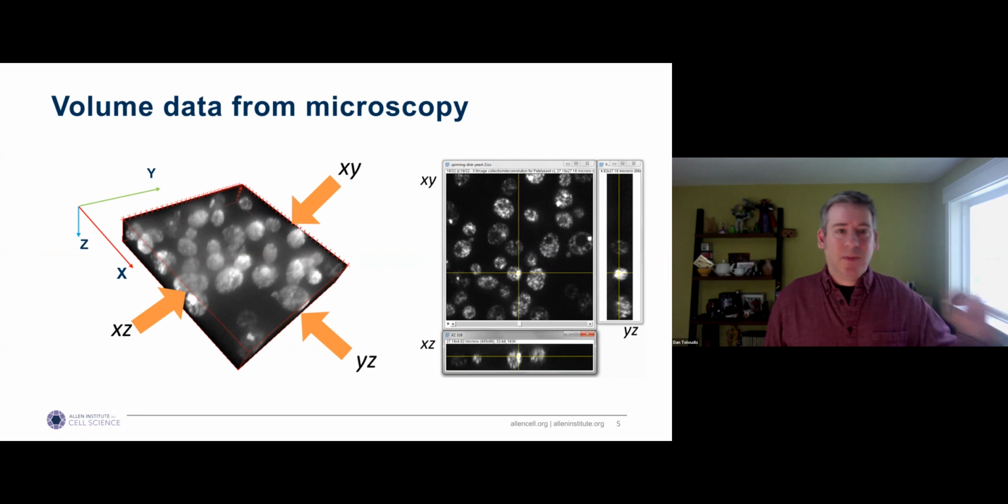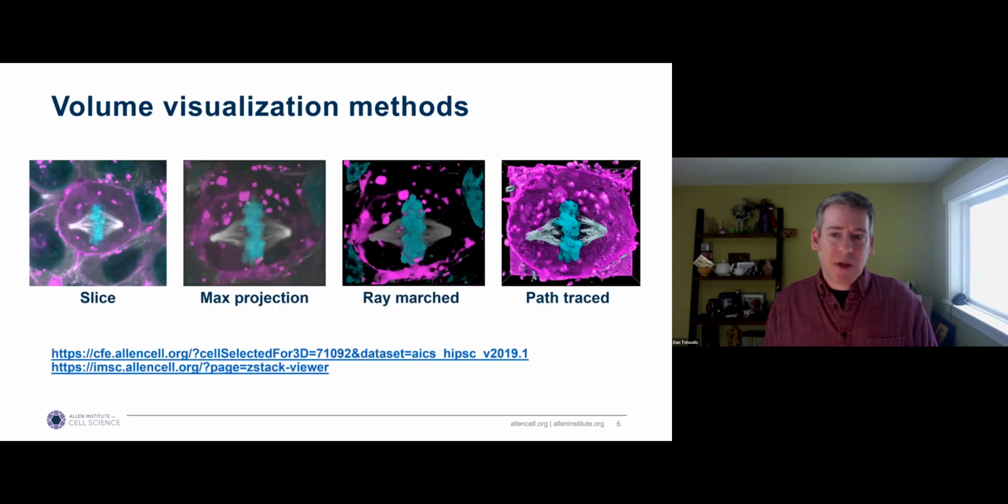Just so that, because the Z-axis is going to be prevalent in a lot of the visualization modalities I'm talking about, when I say Z a lot, you're going to know that's what I mean by Z. And the other thing that's interesting to note is that the values captured by the microscope are typically just intensities. These are just single numbers, scalar values. So we're basically dealing with a 3D brick of numbers, and we have to turn that into a picture.